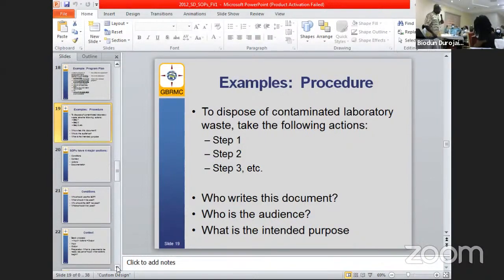In good laboratory practice, the QA officer would not write a procedure for electrolytes, urea and so on. No, sir. The lab manager, who is an experienced person, having grown through all the stages of laboratory practice, who is expected to have understanding across the board, becomes the custodian. It is my duty to sign some documents. I would say, since this document is coming from your area, please write it for me. But if issues come up, nobody will talk to him; I will be addressed. So the lab manager is the custodian.